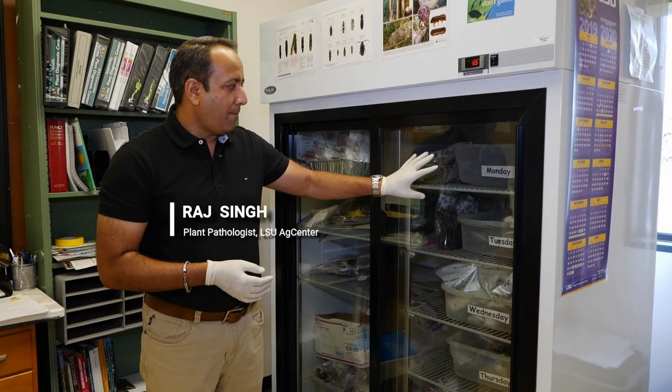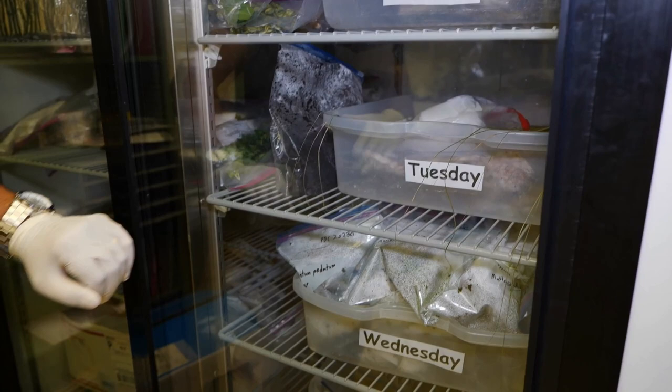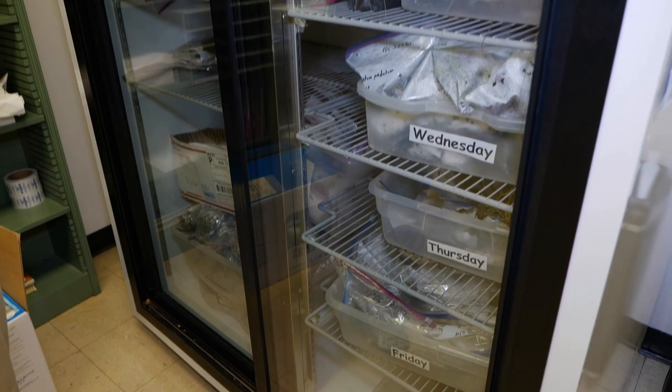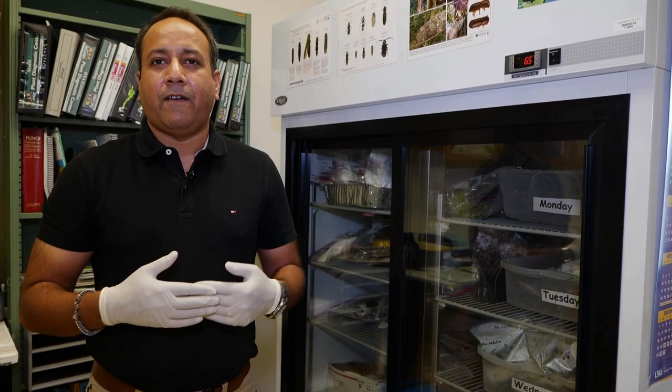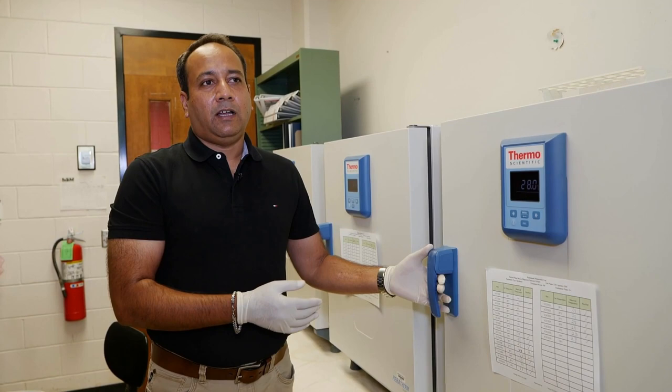We also categorize our samples depending upon which day we receive them. If you send a sample on a Monday and we receive it Tuesday, that will go there in Tuesday, so that if we have to go back, we are not looking for the sample. We are very systematic here. Some days you get more samples, some days you get less samples. But we generally recommend that if you are interested in submitting a plant sample, you want to do it early in the week so we have time during the rest of the week to diagnose that problem. Your sample doesn't have to sit over the weekend here at the diagnostic center in order to be processed.